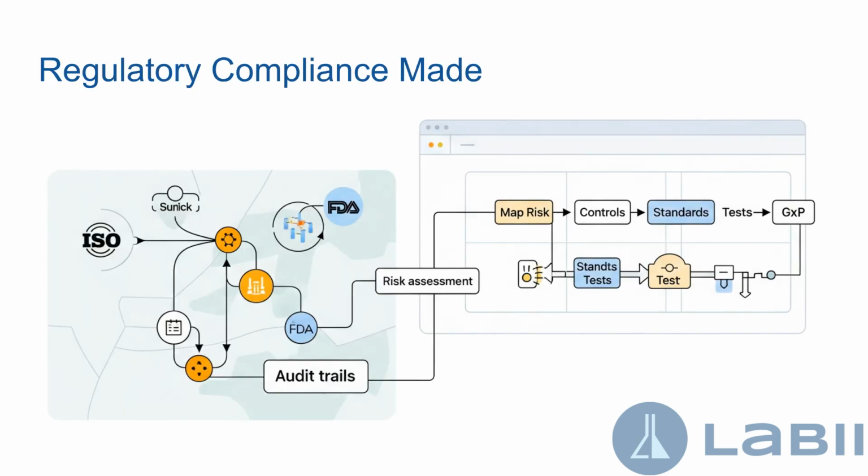Regulatory compliance made easy. Designed for regulated environments, Labii provides built-in audit trails, digital signatures, and compliance-ready reporting. Map each risk to controls, standards, and tests to satisfy ISO, FDA, and GXP requirements.